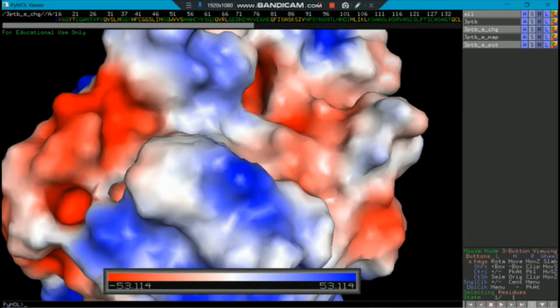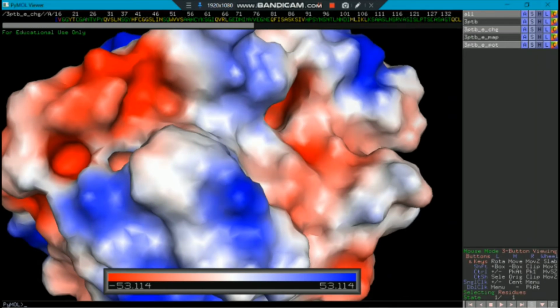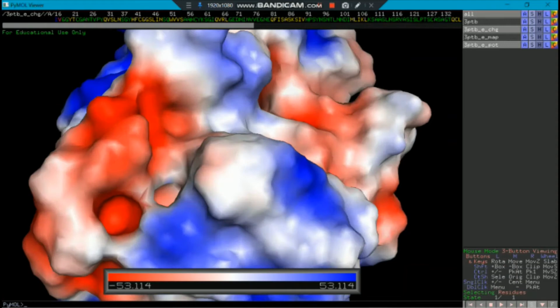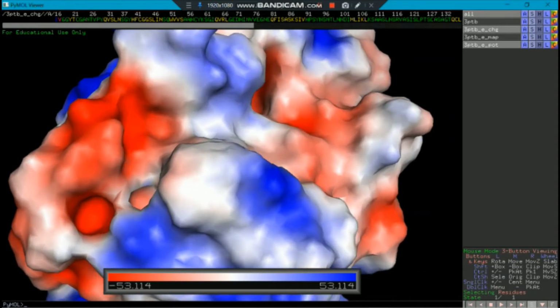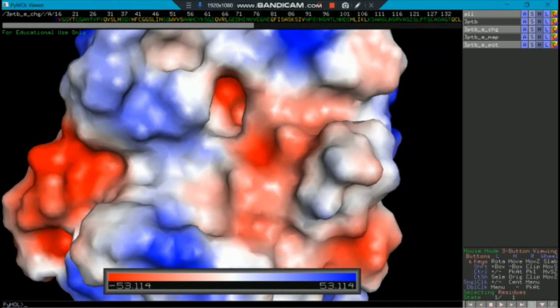I see another binding pocket here. The hydrophobic pocket is also there, so let us explore that particular hydrophobic pocket. Maybe that is a possible binding site for our ligand, right? The binding site must have neither too big nor too small an accessible area, the solvent accessible surface area. There should also be hydrophobicity. These are the two requirements we currently have for our binding pocket.